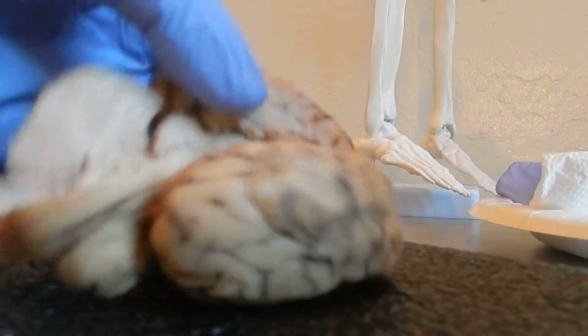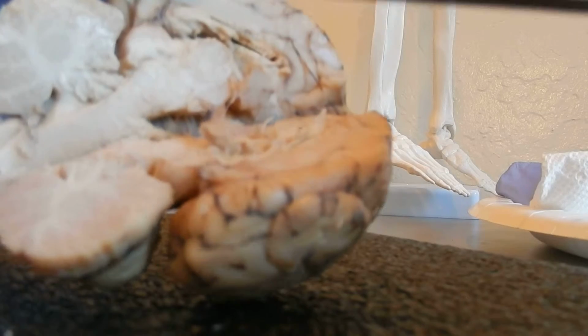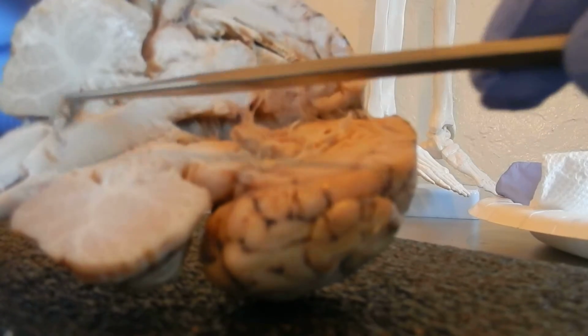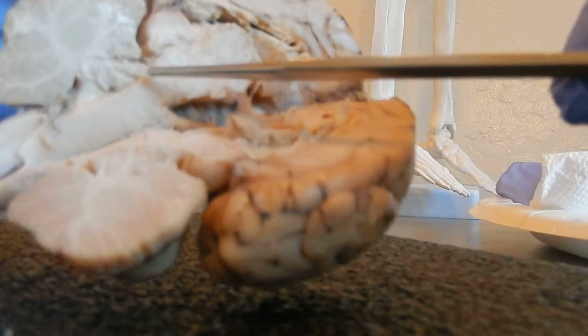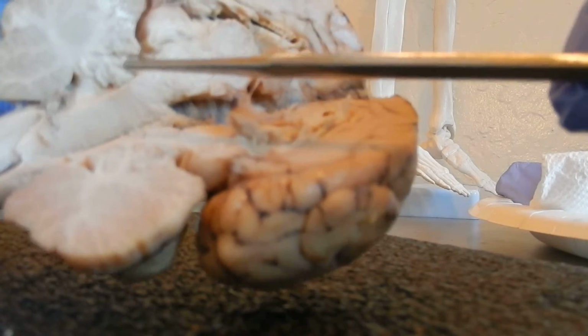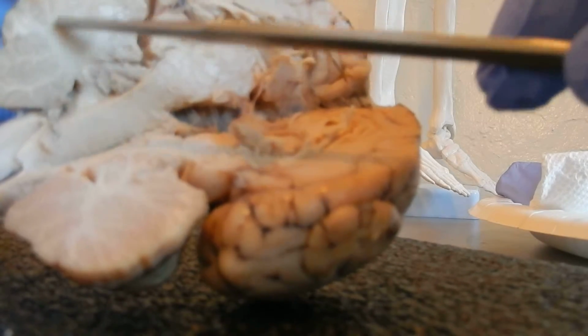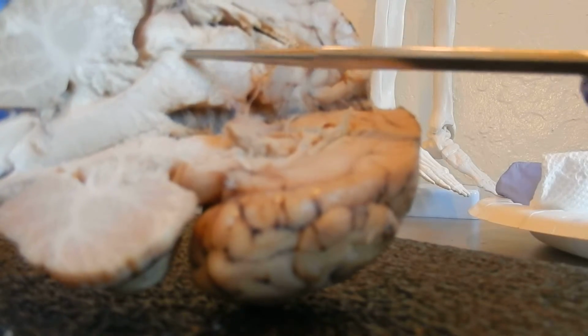This side looks a little better. You can see the fourth ventricle. You can see the colliculus, cerebellum here, and the white matter from the cerebellum in this area.